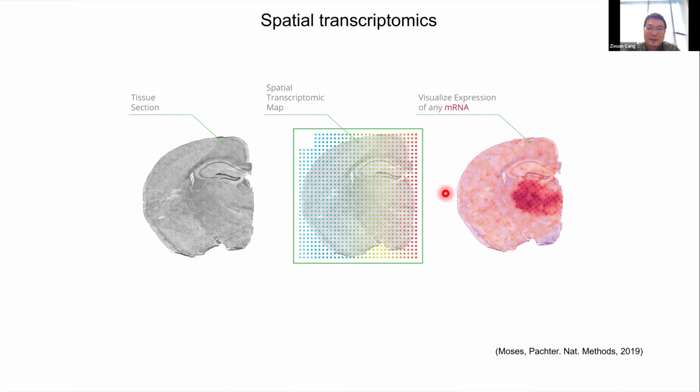When we consider cellular communication, it is usually more reliable to look at populations or groups of cells rather than individual cells. So in spatial transcriptomics, intuitively, it's probably better to group the cells based on both their cell type and also their localization.